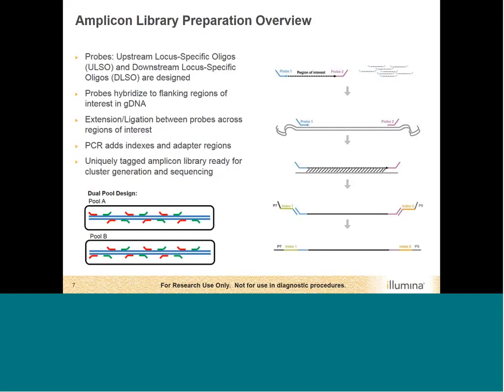So what you're going to get is a mirror image of your original oligo pool that's going to have the same amplicons but on the opposite strand. So together with pool A and pool B, you're going to sequence your entire target region, both strands, and you can confidently distinguish these variants from any artifacts of the FFPE process.